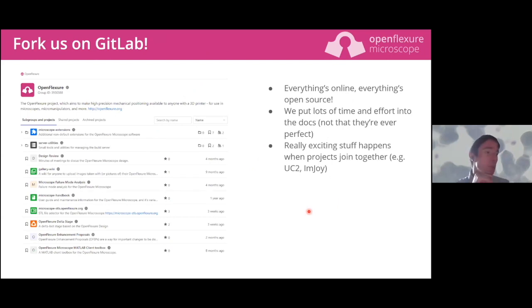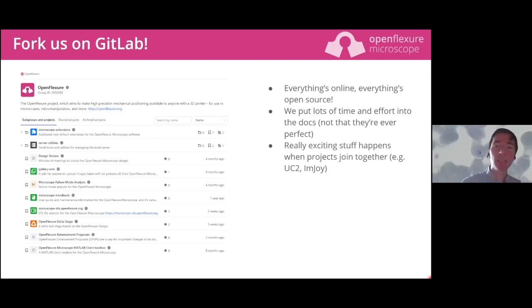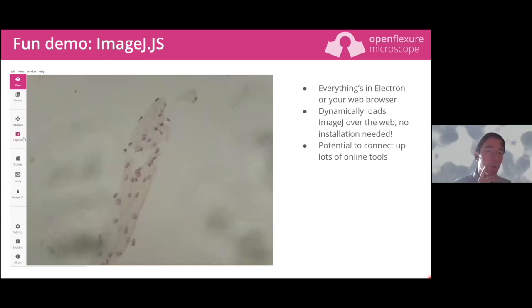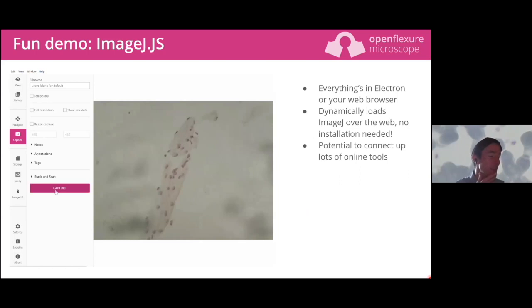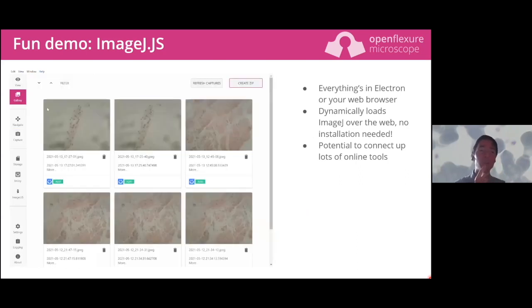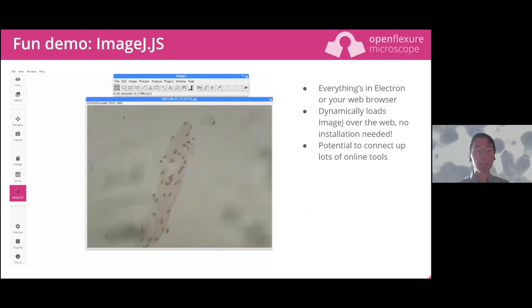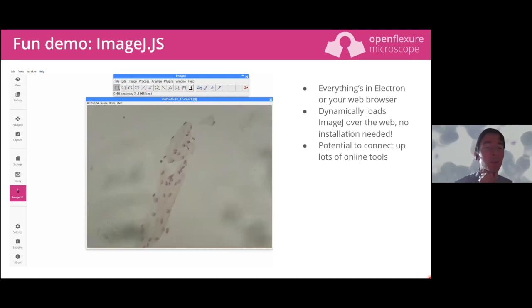Everything is available on GitLab - openflexure.org is probably the friendliest place to get started, but absolutely everything can be hacked about with and explored. It's designed to be extended. Here's a demo: we can capture an image in the microscope control software and load it in ImageJ, embedded within the microscope control software, all enabled by ImJoy - a fantastic plugin architecture for connecting different web apps for image analysis and microscopy.